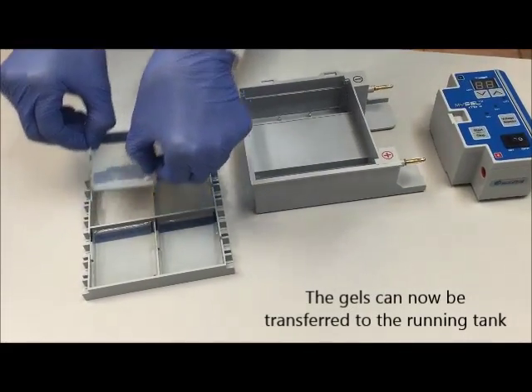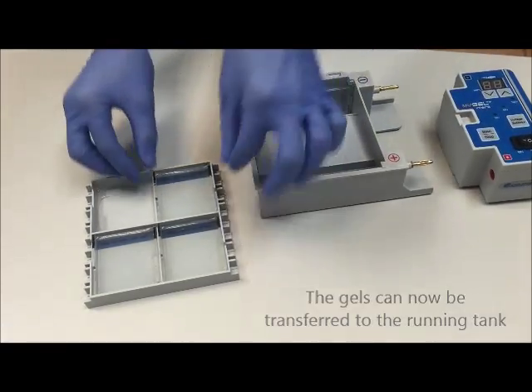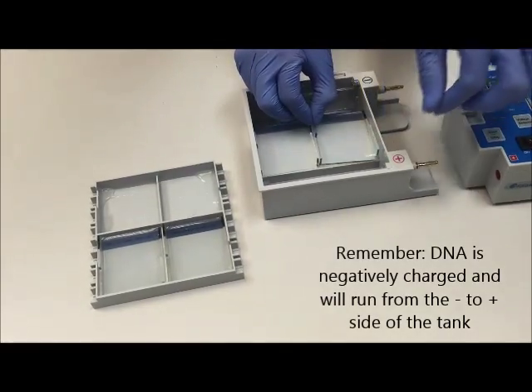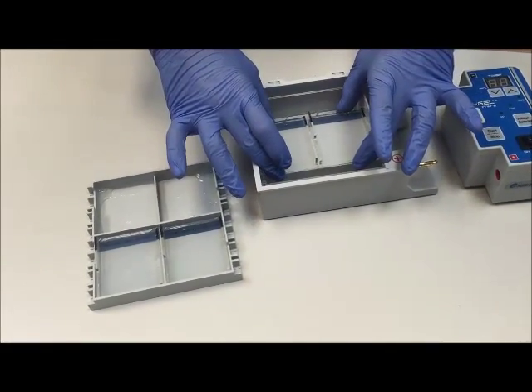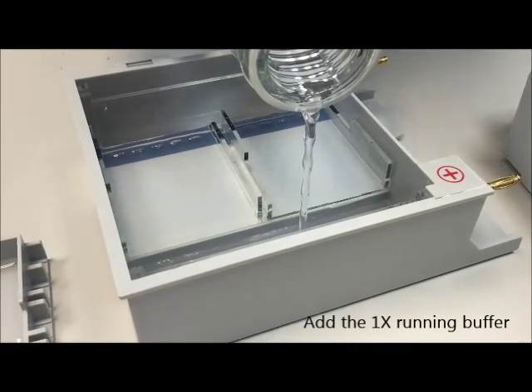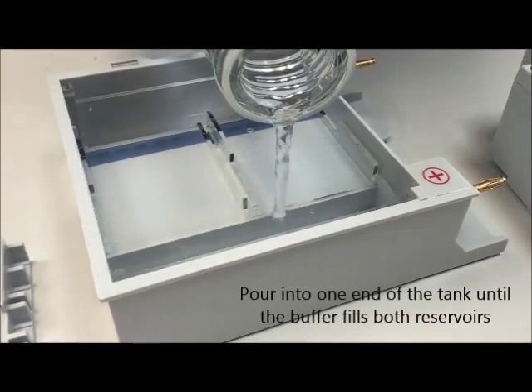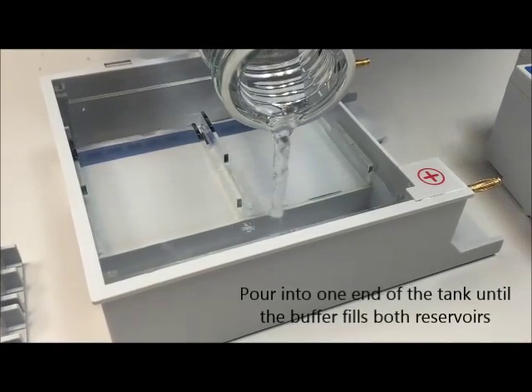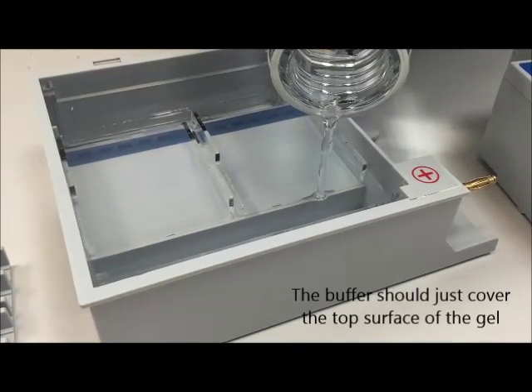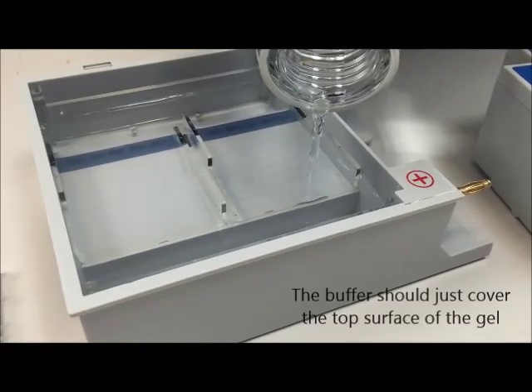The gels can now be transferred to the running tank. Remember to put the gels in the right orientation — the DNA will be running from the negative side to the positive side of the tank. Next, add the 1x buffer to the running tank, slowly pouring into one end until the buffer fills both reservoirs. There is enough buffer when both reservoirs are filled and there is a small amount of buffer covering the gel.